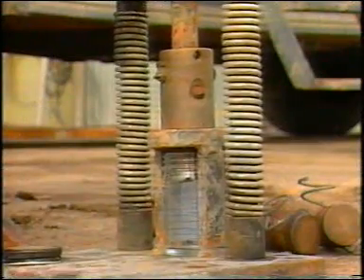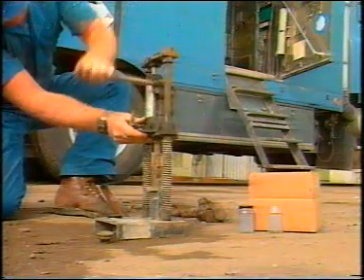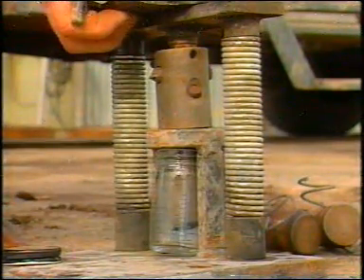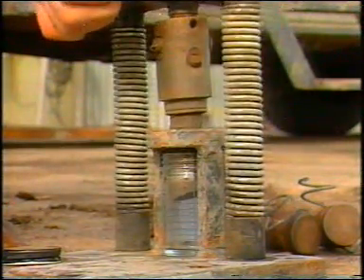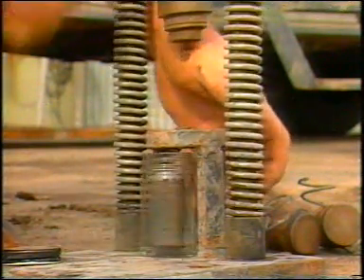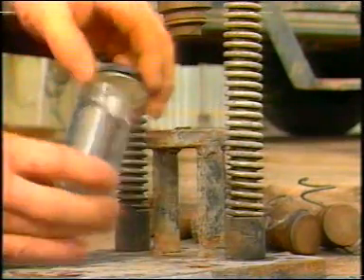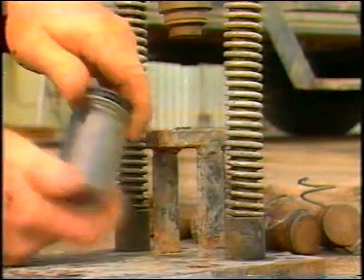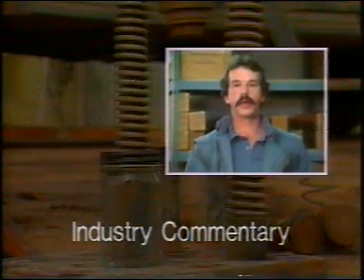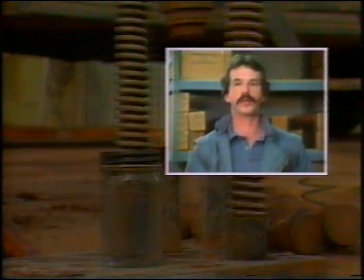Sidewall cores are removed from the metal projectile, placed in small jars, and sealed immediately. Depth should be recorded on the sample jar. Non-absorptive material such as foil or saran wrap may be added to the jar to prevent sample movement. Once the jar is closed, don't open it again until just prior to analysis. Keep in mind that poor handling and packaging of cores at the well site can cause the core samples to weather, and improper labeling of boxes can cause great confusion at the lab.